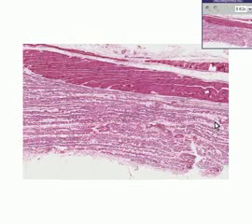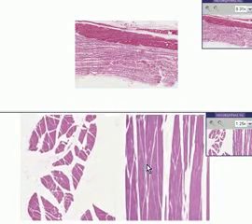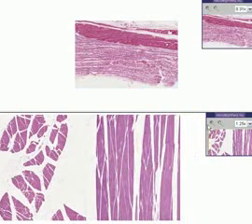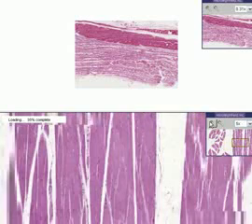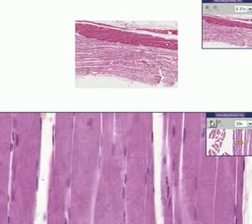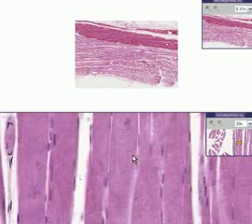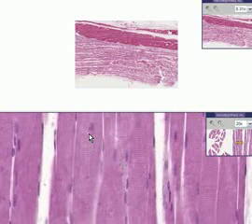Here is the disease in question to be discussed today regarding skeletal muscle. And here, on the bottom, is absolutely normal skeletal muscle. Let's look at it and look at all the salient features. I think you can very easily see the striations. I think you could see that the muscle fibers are basically right next to each other, lined up like logs.